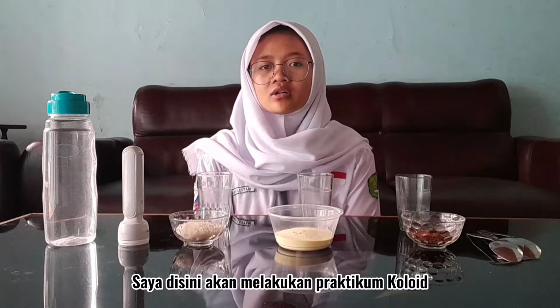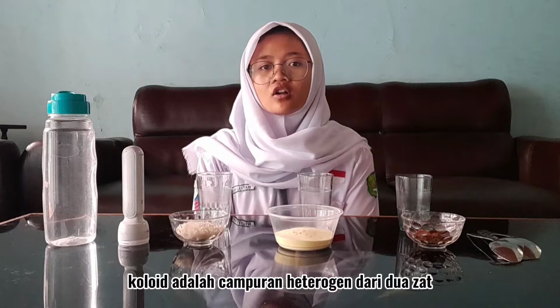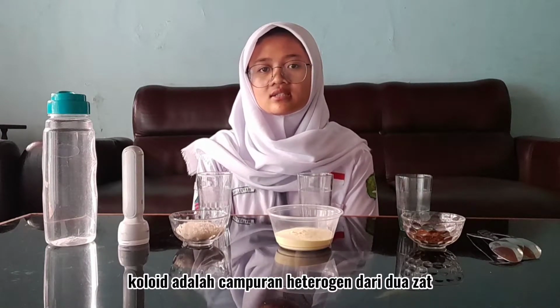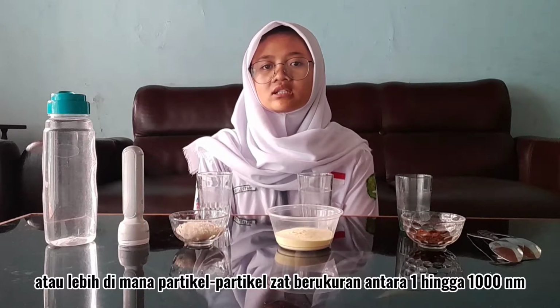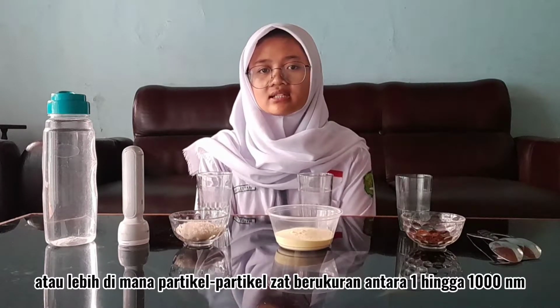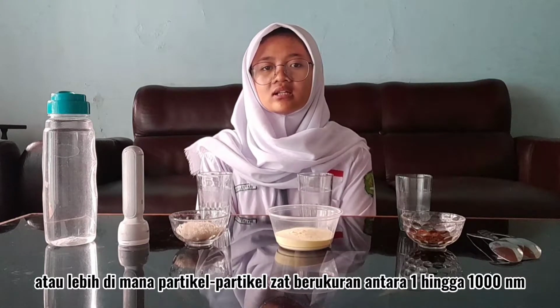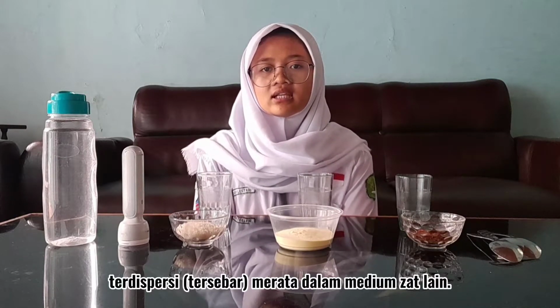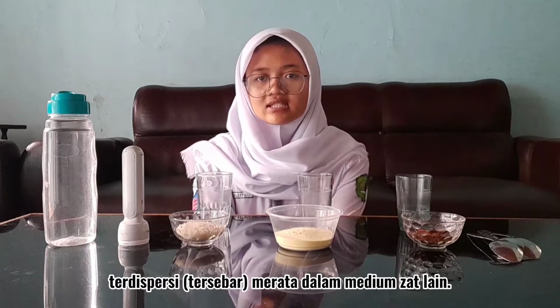I'm here to do a Colloid Practicum. Actually, what is meant by colloid? Colloids are heterogeneous mixtures of two or more substances in which the particles of a substance measuring between 1 and 1000 nanometers are evenly distributed in the medium of another substance.